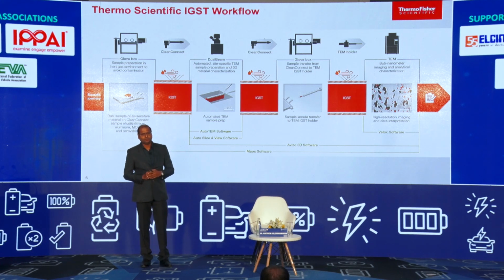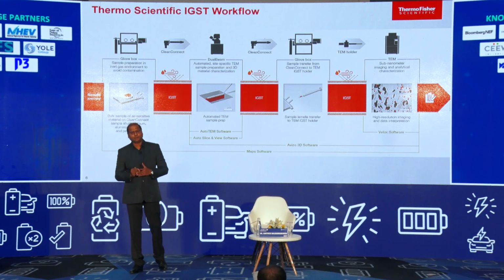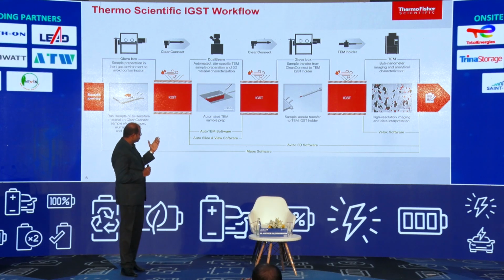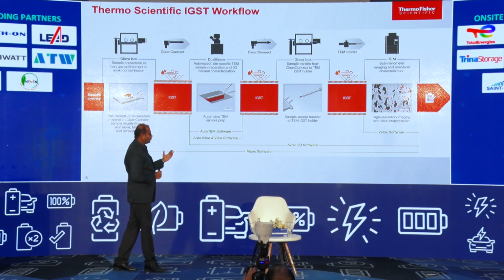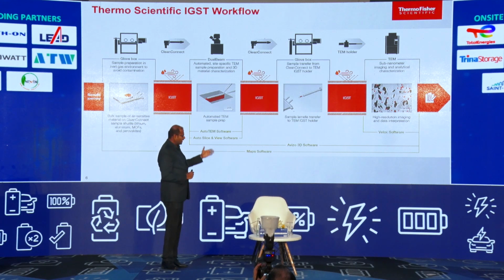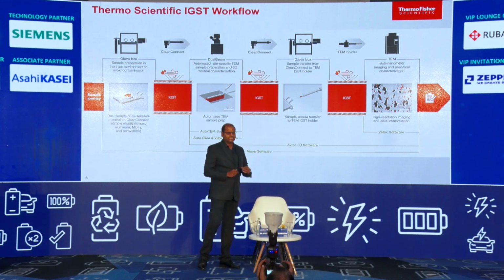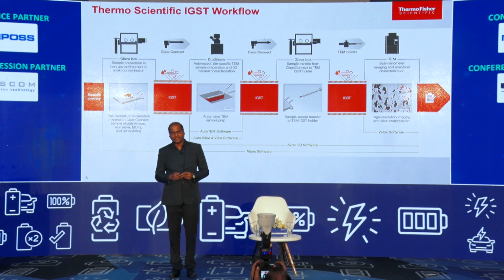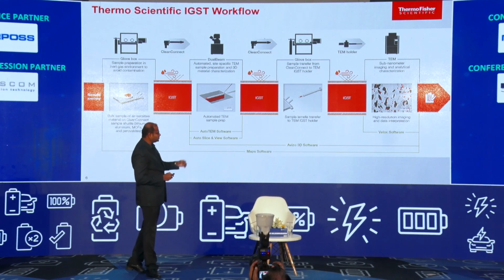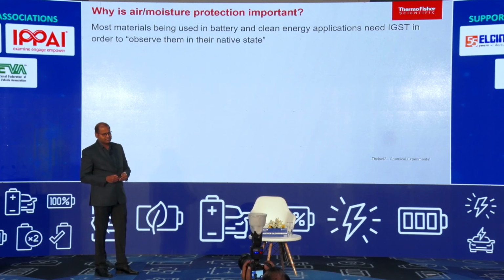Because when it comes to characterization under a transmission electron microscope, there are stringent requirements on the thickness of the sample that can be used. So here we provide a dual beam solution which helps you to make an automated TEM sample preparation. And once the sample is prepared, we transfer the samples to a transmission electron microscope and that helps to understand the material down on an atomic scale. And over this presentation, I will present the workflow or the overview of these instruments.